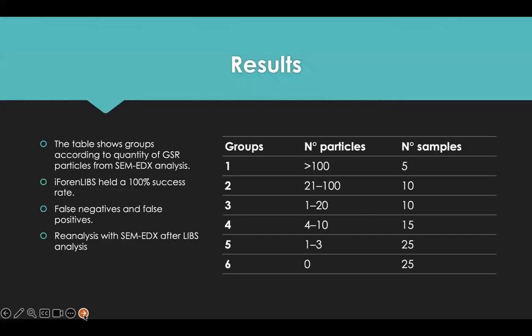Reanalysis determined that to obtain a positive reading in all elements, the particle size must be greater than 1 micrometer. In addition to that, particles greater than 2 micrometers are not totally ablated and can be analyzed again by SEM or other techniques.